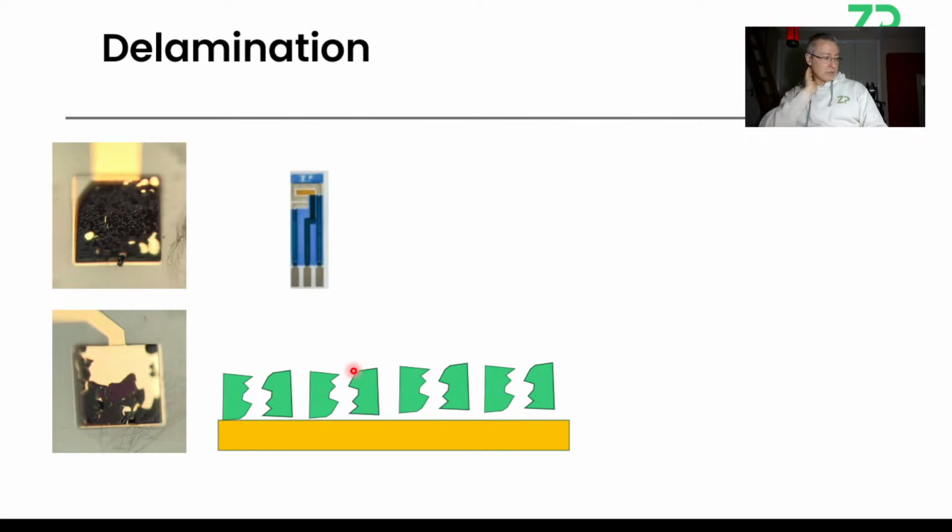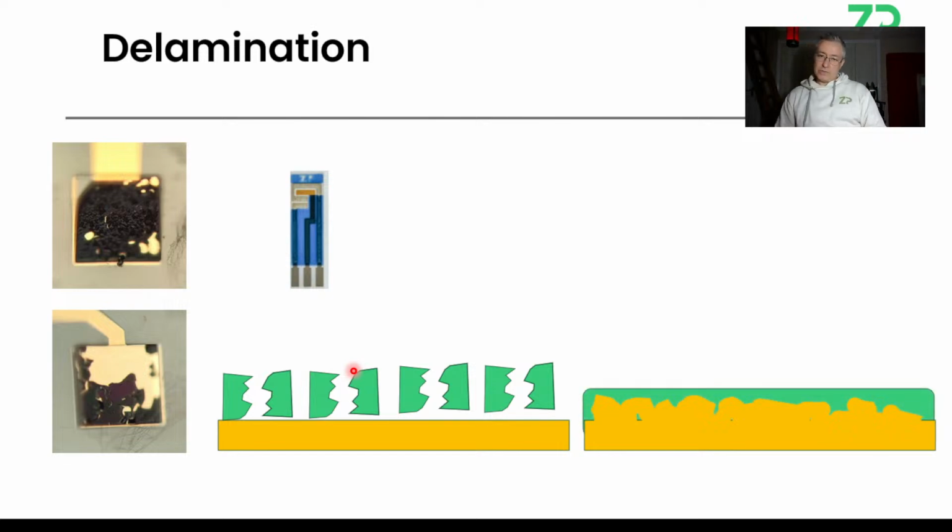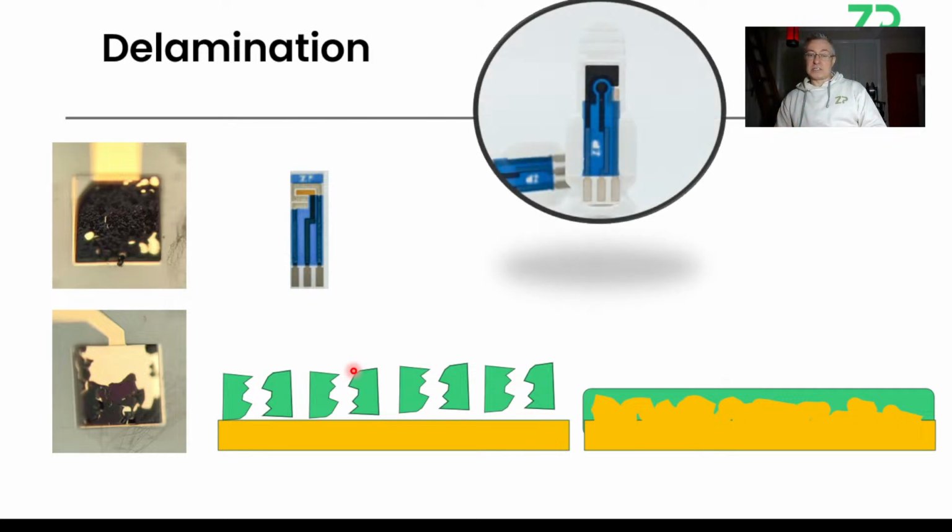We do a lot of electropolymerizations ourselves, but we do it on our gold electrodes, and I suspect that our gold, well, you can almost see it, is duller than their nice shiny gold. So we've got a rougher surface, and with a rougher surface, the PEDOT:PSS can literally grip the surface, because there are nooks and crannies that the PEDOT can polymerize in, and so it's anchored on the surface by almost a physical attachment. But there's no reason why the PEDOT:PSS should stay on the surface with gold. And especially the thicker it is, the more likely it is to come off.